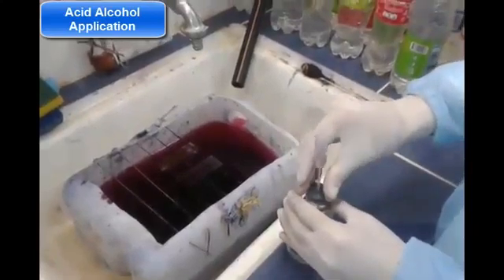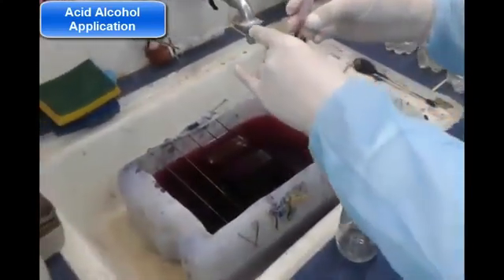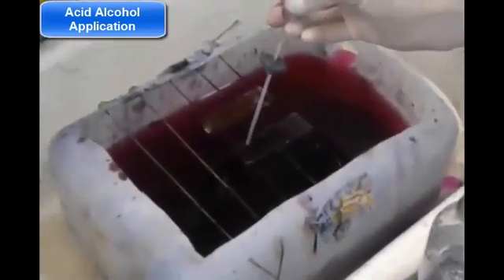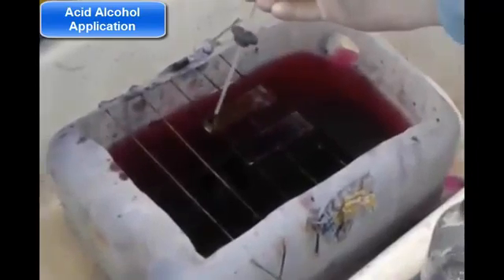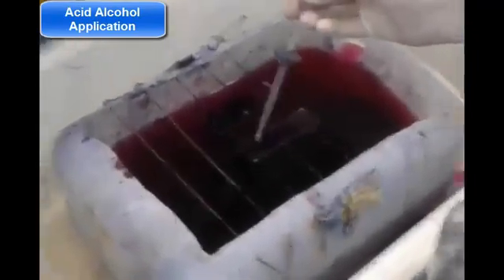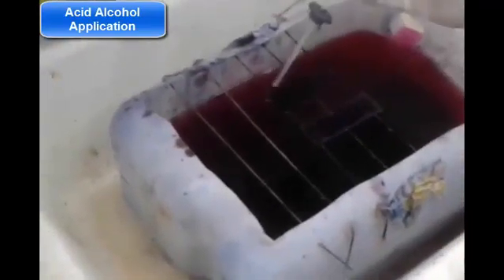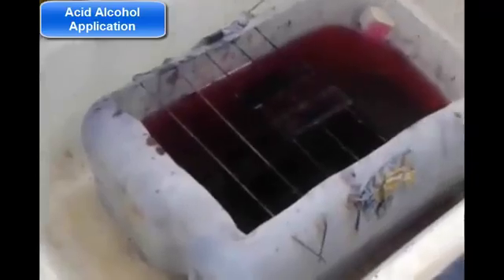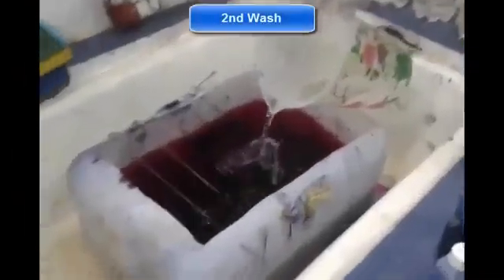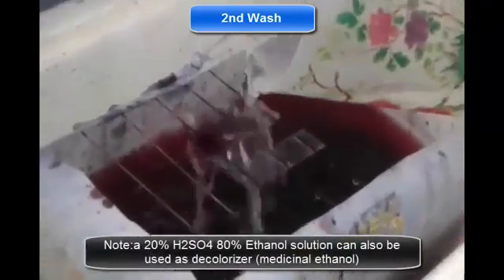For decolorizing the smear we will use the acid alcohol solution. Since this is an acid-fast bacteria, it will not be affected by this substance but everything around it will. Once we pour the acid alcohol solution we will let it settle for one minute. After this we will pour it off with a low pressure stream of common water, and now the slide should look slightly pink.